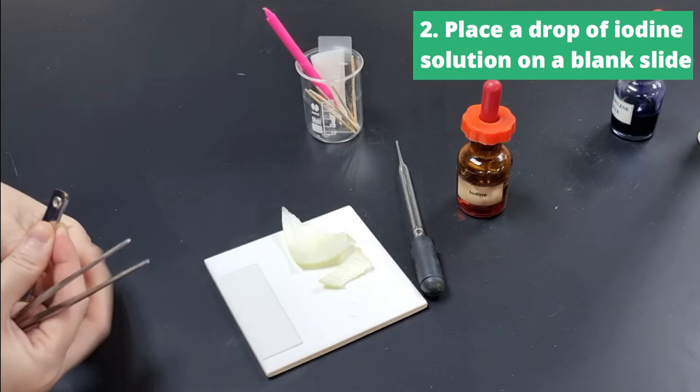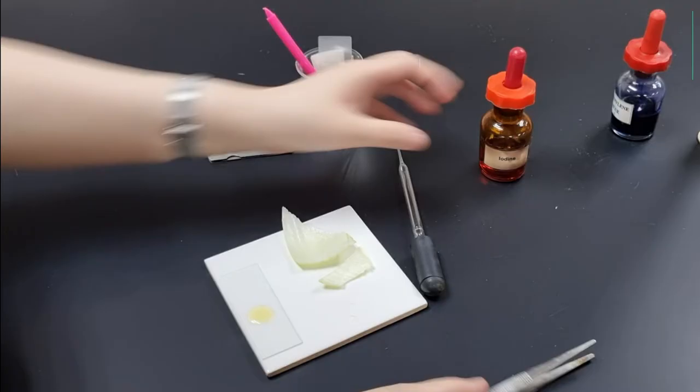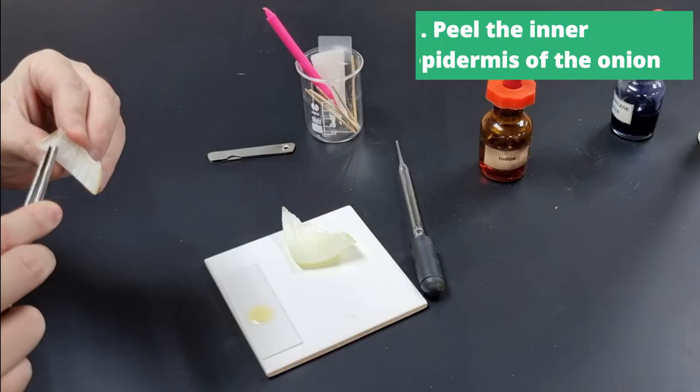We're going to take a blank slide here and place a drop of iodine solution onto the blank slide. So just a drop will do, just a tiny amount, and then now we're ready to peel the inner epidermis.